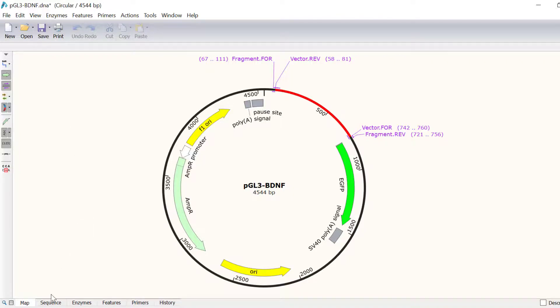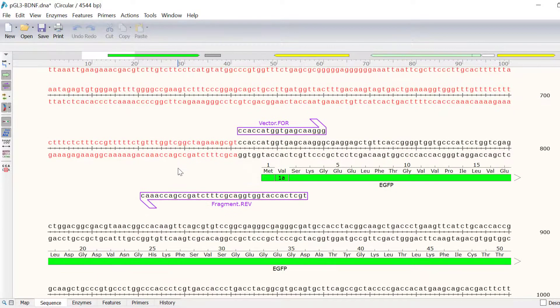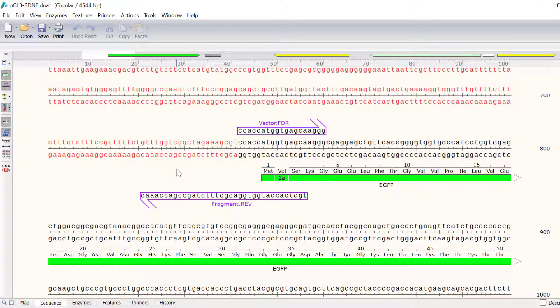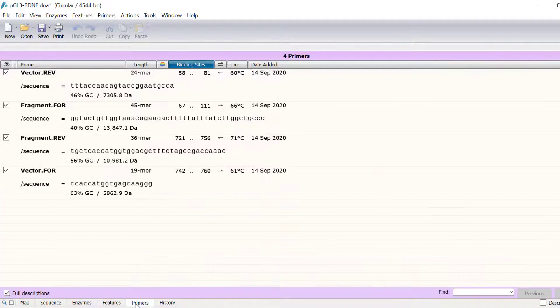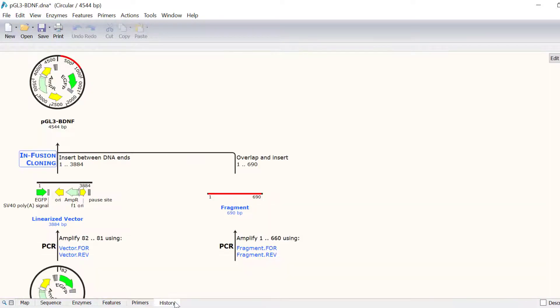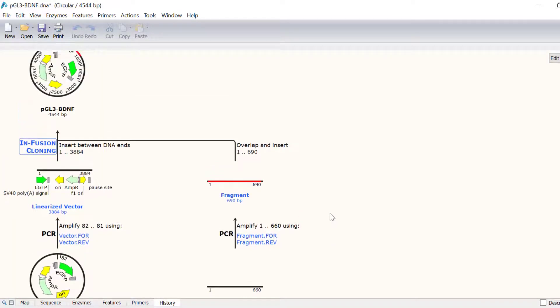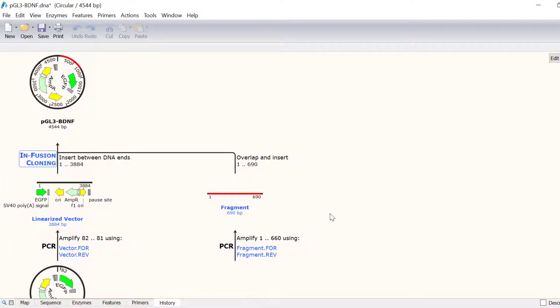By switching to the sequence view, you can see the different primers and the overlaps. The primers view will display all of the primers in the file. Finally, the history view will display the schematic of the simulated workflow. And that wraps up this video tutorial.